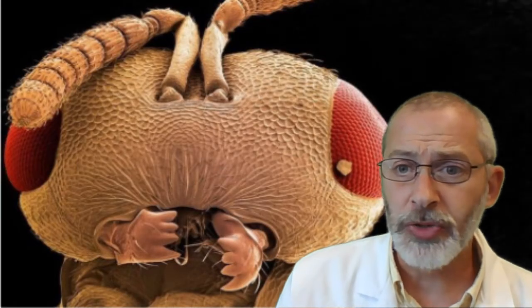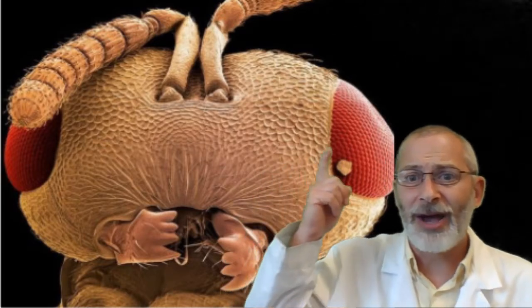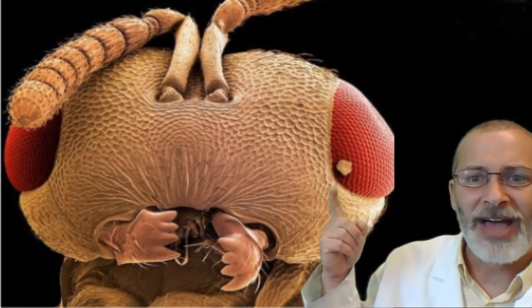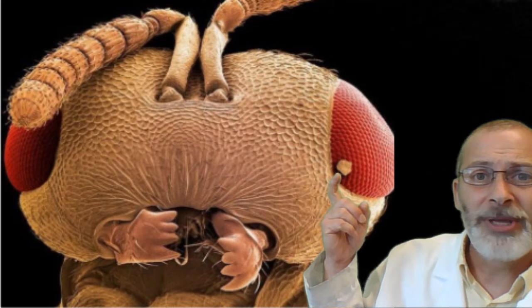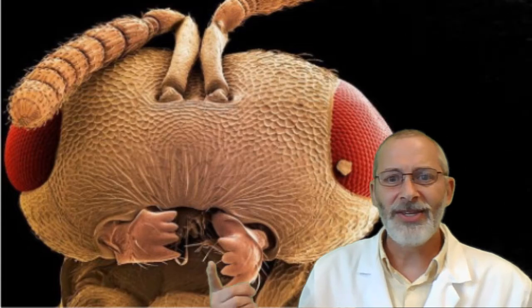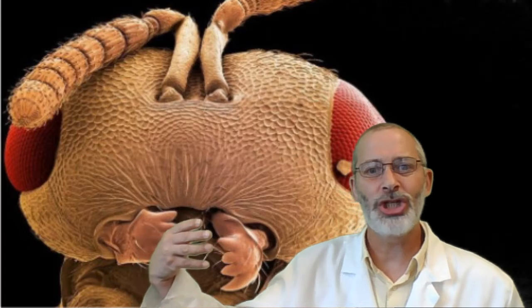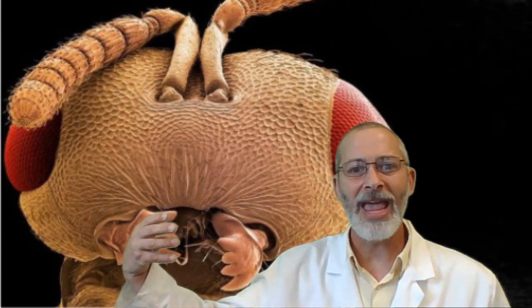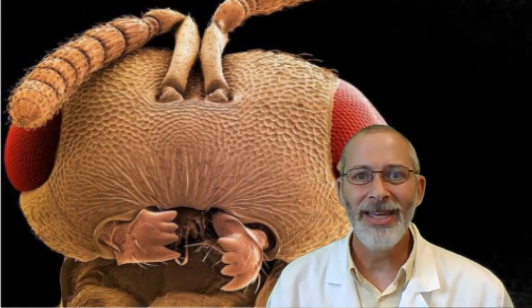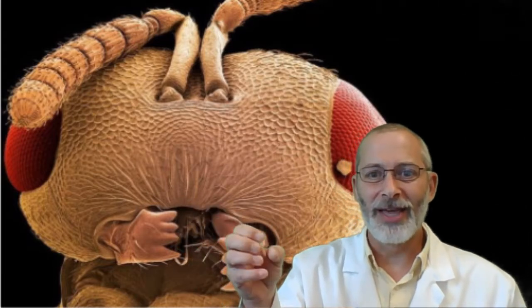Here's a slightly close-up view of the ant's face, and golly, check out his eyeball. This is a compound eye made up of many little facets, and it looks like he's got some gunk in there. Maybe that's a little eye booger. I'm not sure. But look at his mouth. This is his mouth right here, and notice the similarity in shape between my hand and his mouth. Isn't that amazing? His mouth looks like my hand, but those are like his lips that close in.